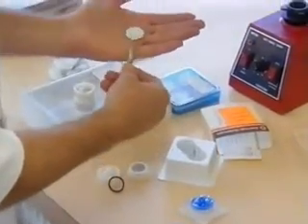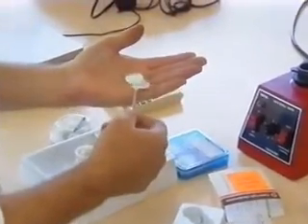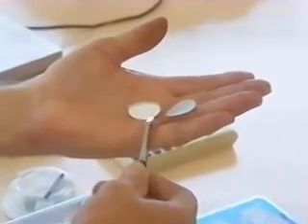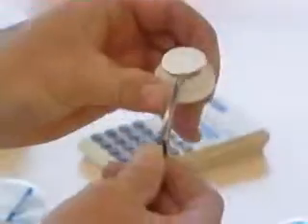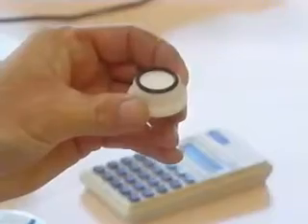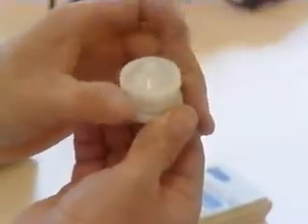Another method of sterilization of media is filter sterilization. In this case, a membrane made of cellulose acetate or cellulose nitrate with 0.22 micron pores is used. This is used only when we are dealing with compounds which are heat labile, such as some of the plant hormones used in tissue culture, for example, zeatin and gibberellic acid.